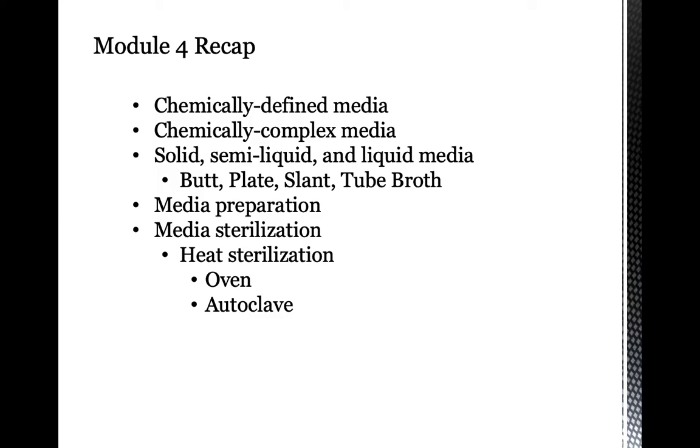It's very important that we sterilize our prepared medium because we want to start with a contaminant-free culture medium. The idea is our culture medium will provide only the nutrients needed, without contaminants that can inhibit or do something to the microbial organisms that you are trying to grow.